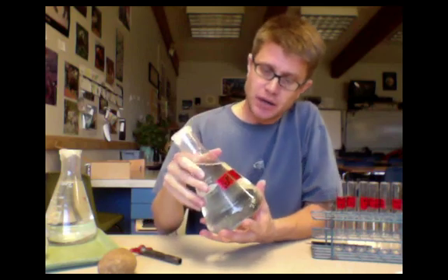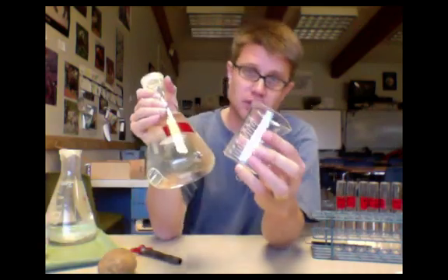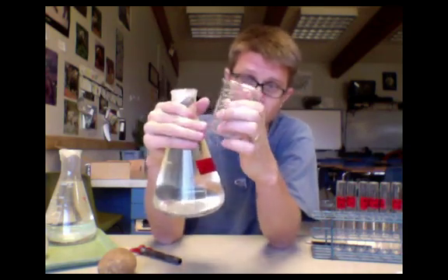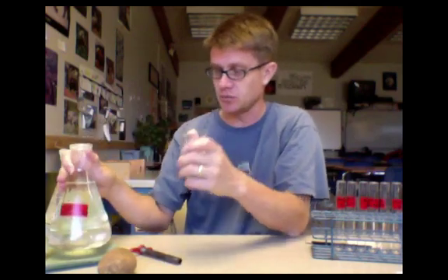It's really hard to pour out of these Erlenmeyer flasks, so what I'll do is put a little beaker in front of each one. Essentially you go from the Erlenmeyer flask to the beaker and then from the beaker into each of your test tubes.